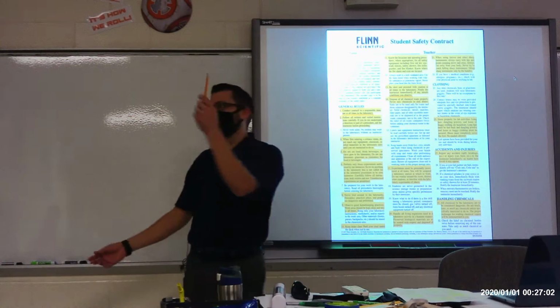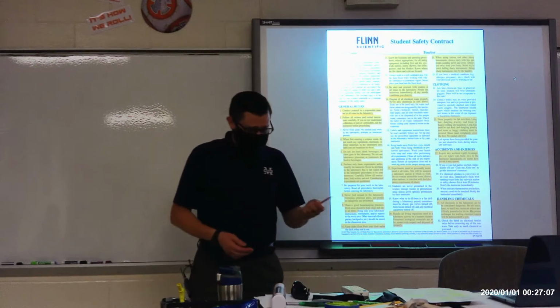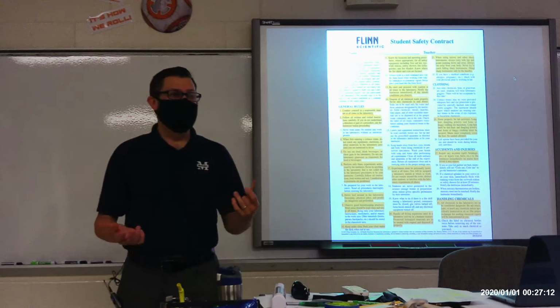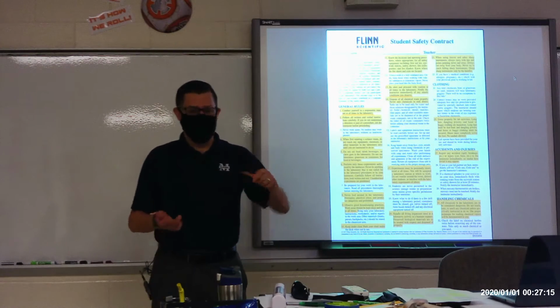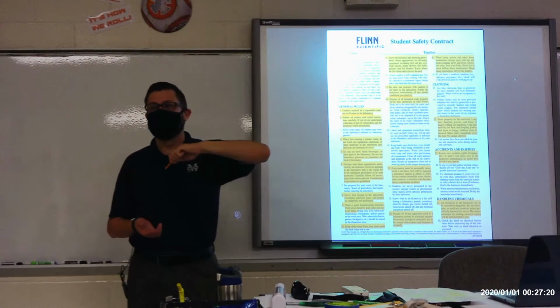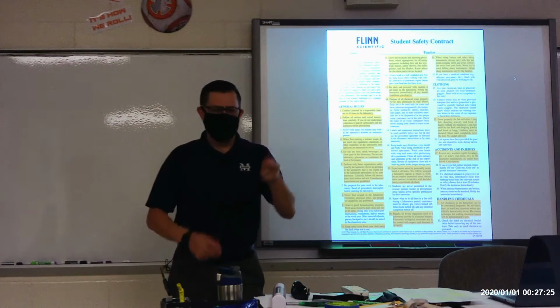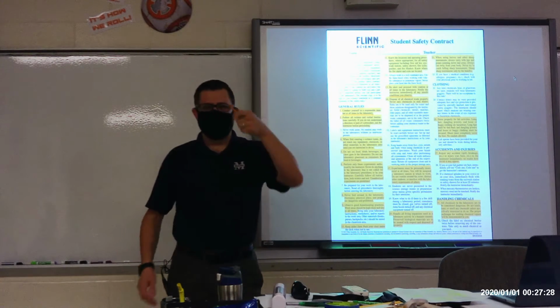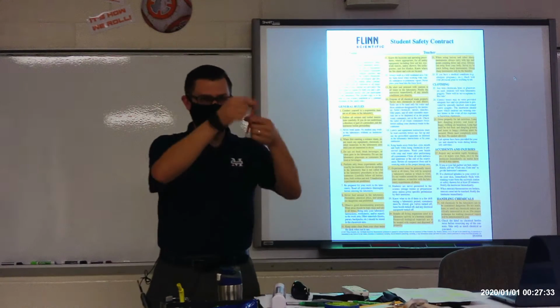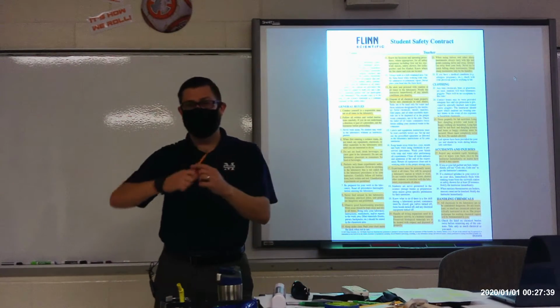Obviously you shouldn't be wandering around carrying a scalpel or running with scissors or anything like that. And I'm always surprised how many students seem to never have held a knife before and don't seem to know how to handle it. If you're cutting, you cut away from yourself. You don't cut towards yourself because if you slip, that's going into you. Also, if someone asks you, hey, could you hand me that scalpel over there? You don't hand it to them point first. Because if they're not paying attention, they reach out and grab it, they're grabbing the sharp end of the scalpel. So what you do is you flip it around and hand them the handle. Okay, so they're grabbing the handle and not grabbing the sharp thing.